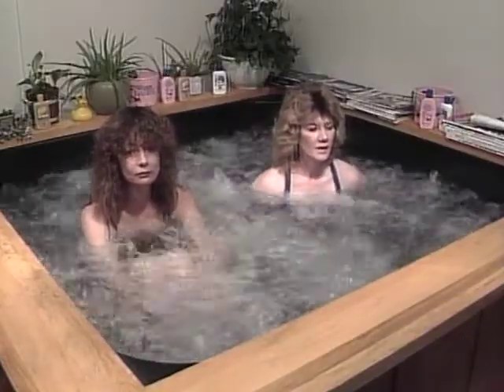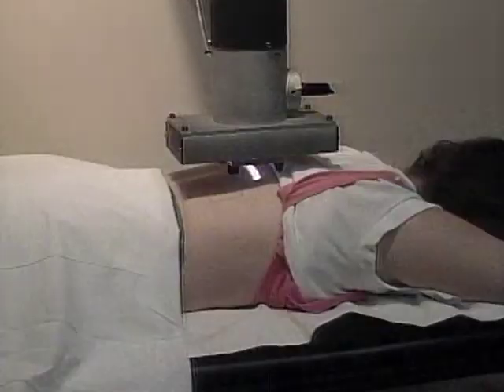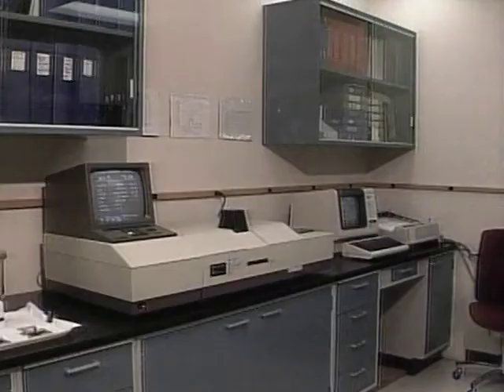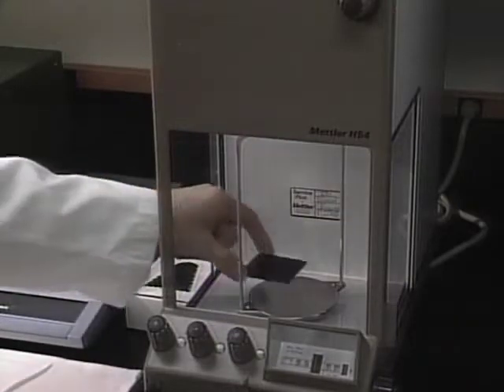We try to select molecules that have the electronic structure that can absorb the radiation. That they will sit on the surface of your skin and basically protect you by absorbing the incoming radiation before it can penetrate into the skin. Schering-Plough tests its products extensively to see how long they stay on in the water and how well they absorb ultraviolet radiation. The most accurate way to measure ultraviolet absorption is with spectroscopy.